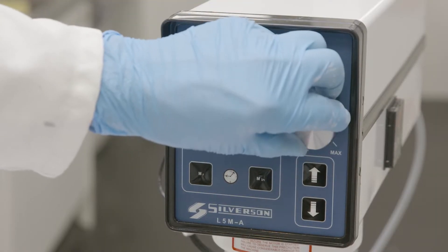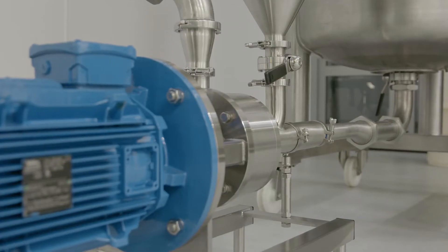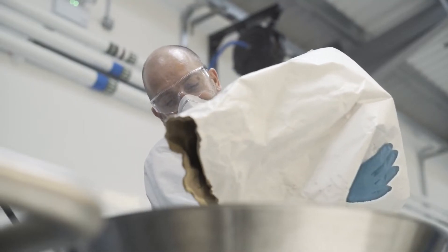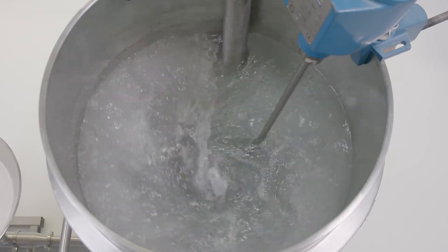Silverson offers a range of equipment for making pectin solutions, including laboratory-scale mixers, Ultramix and batch machines for larger volumes, and for large quantities of powder and higher viscosity solutions, we recommend the Flash Mix. The powder is loaded into the hopper at floor level and rapidly drawn into the liquid stream by the self-pumping mixer, ensuring an agglomerate-free solution time after time.